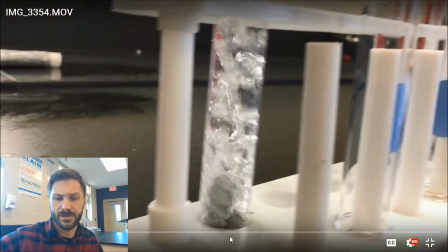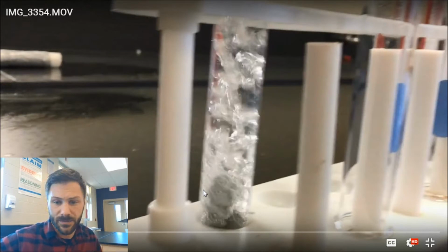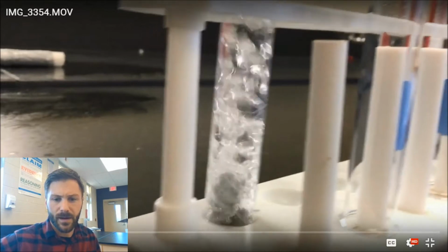Another thing that was observed is people noticed that the test tube was hot, started to get warmer. The longer the reaction took place, the warmer it got, in fact. So heat's getting released in this reaction. So what's that called? We're going to get to that, but we know right now just from our initial observations that there are bubbles being produced, the zinc appears to be breaking up, and there's heat being produced. So that is some of our reactions right there.